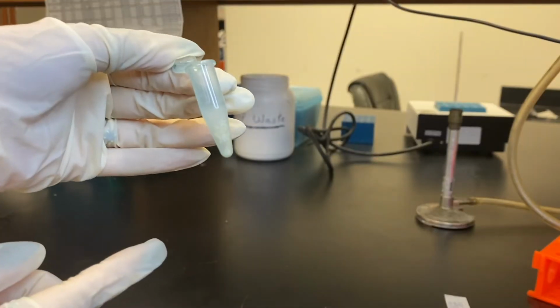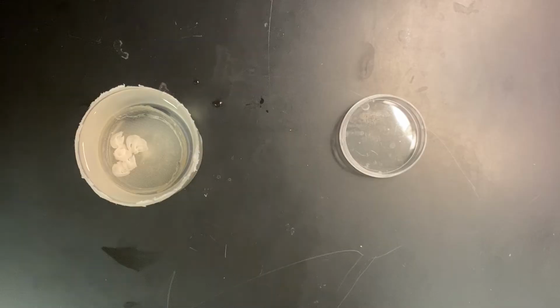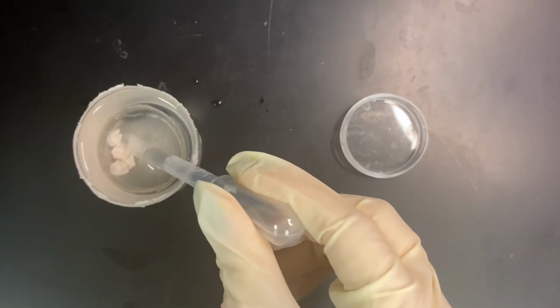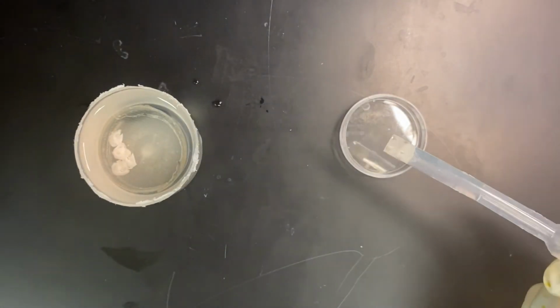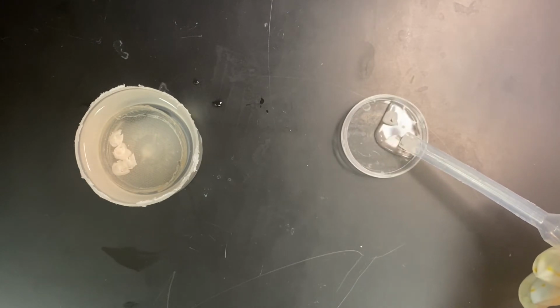So, at this point, I decided there was only one thing left to do: throw it in the trash and start all over again. This time, I was going to be a lot more careful about letting the brain mold. So instead of using a fixed tissue, I used a live tissue. This should allow the DiI to diffuse faster than mold can grow.